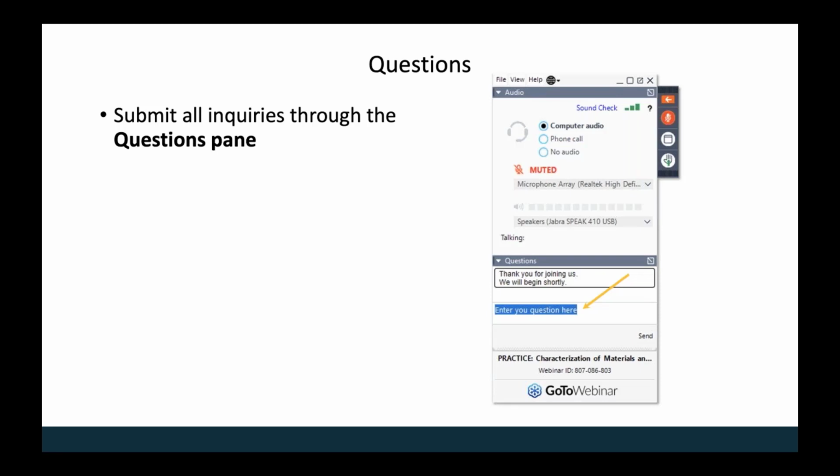Stephanie, maybe a question for you. What kind of samples benefit from energy filtering for phase retrieval? Yeah, I think it's going to depend on how much unwanted background scattering that you have. So again, I think thickness is going to be one of the main determinants, but also just in general, how much plasmons and what you expect from your sample. So some samples will have a lot more background scattering than others. But in general, I think thickness would be the main determinant.